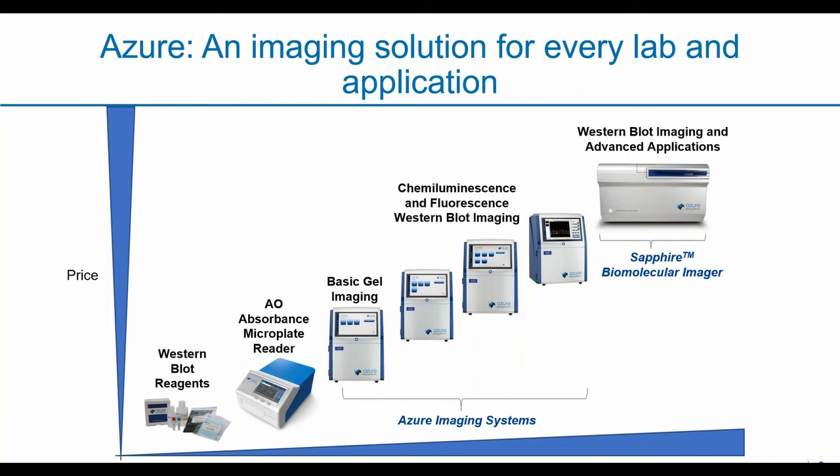Okay, let me see. We have a question from Putri: can we proceed with fluorescent Western blot if you use the iBind Western system? I'm not sure about the iBind Western machine. You might need to check the specs, what kind of excitation light sources they have. For fluorescence imaging, fluorescent Western blot, you need the excitation light sources and detection as well. The detector might be a CCD, but for the excitation light source, you need to look at whether your system has it or not. If your system has the excitation light source, then yes, you can do fluorescence Western blot. That means you can excite it and you can detect it. I hope this answers your question.